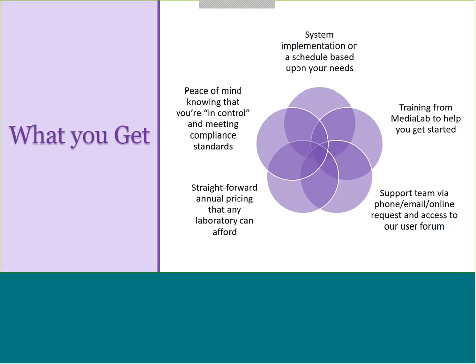And finally, what you get really is the peace of mind in knowing that you're in control. You're meeting those compliance standards. Since we only work with laboratories, we really have pre-built a lot of those compliance requirements right into the software to make life easy for you.